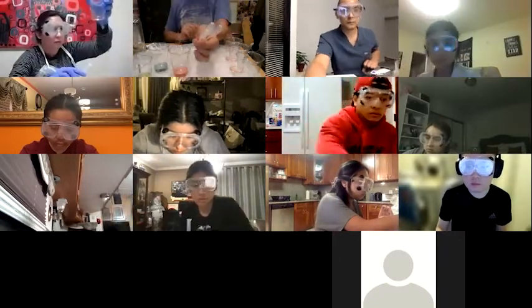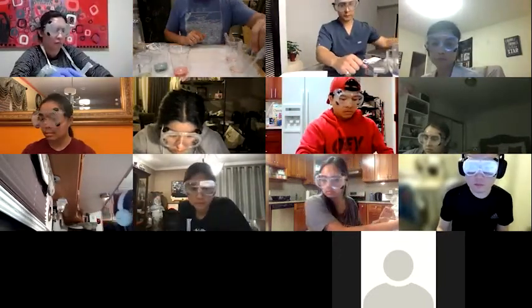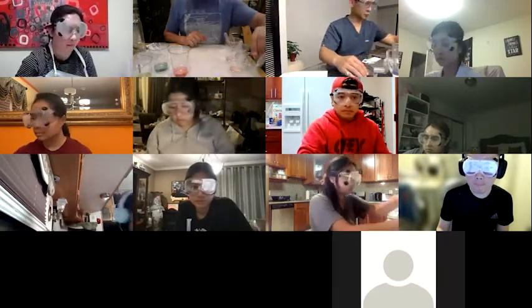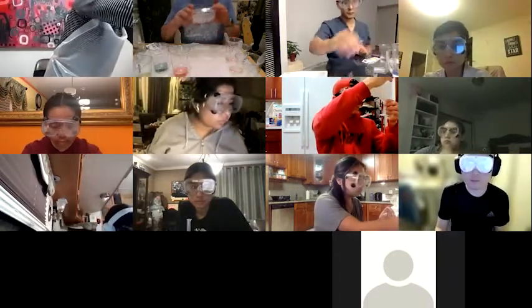So I'm just going to take a transfer pipette and just put them one in each. That way I'll only use this transfer pipette for this particular buffer. And I'll get my plate ready. Make sure it's clean. Yep.